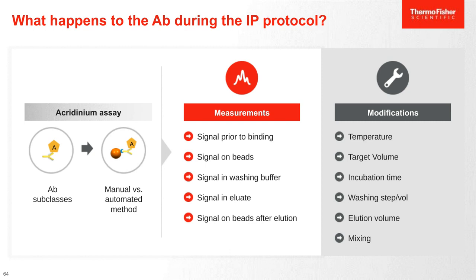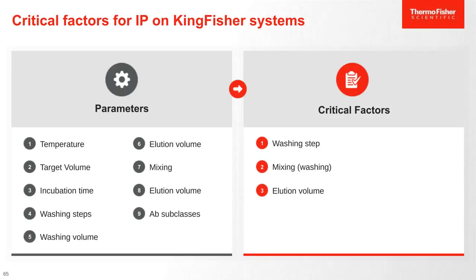And we looked at parameters like temperature, target volume, incubation time, washing steps and volumes, but also the elution volume and mixing conditions.